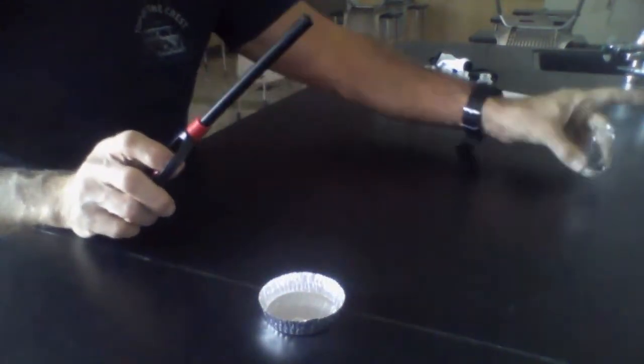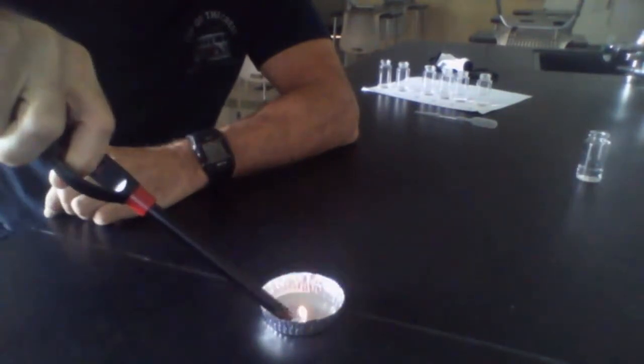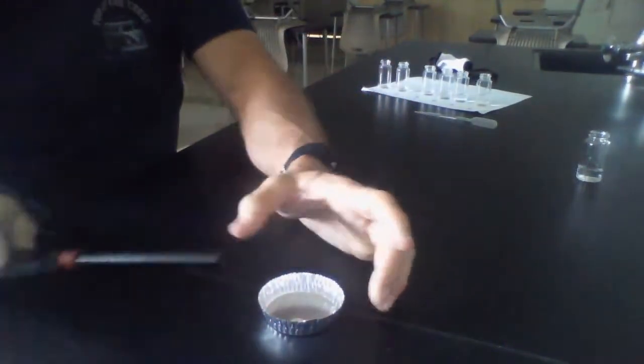I move everything far away, and as you might expect, non-flammable, no flame at all.